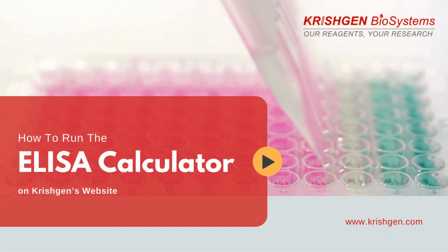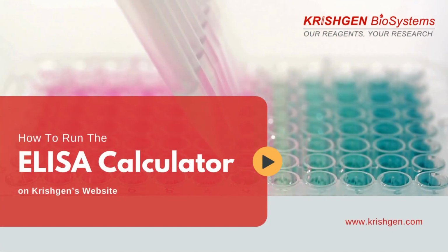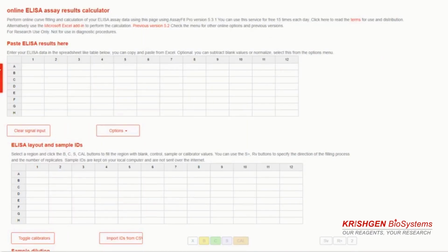Krishgen's online ELISA calculator is an easy tool and can be used up to 15 times per day per user. This video will provide a quick step-by-step guide on how to run it.